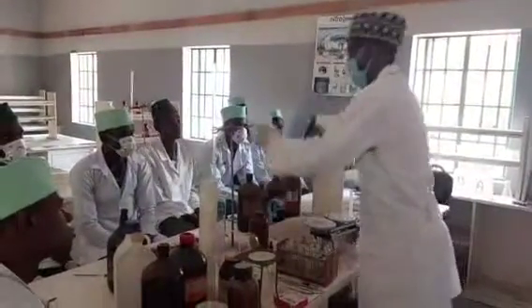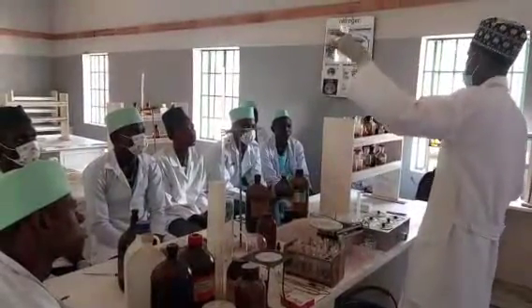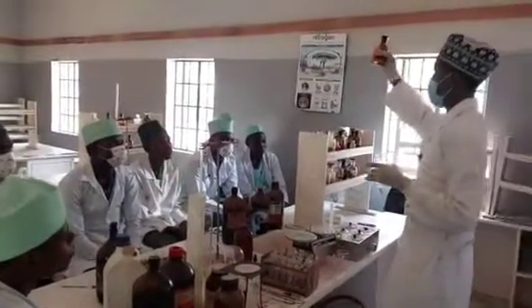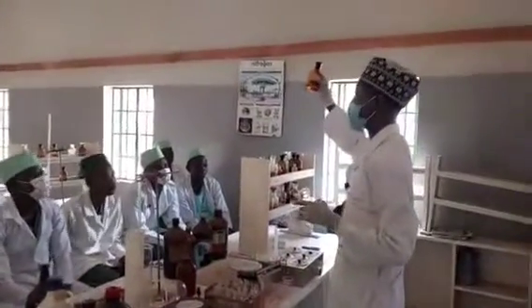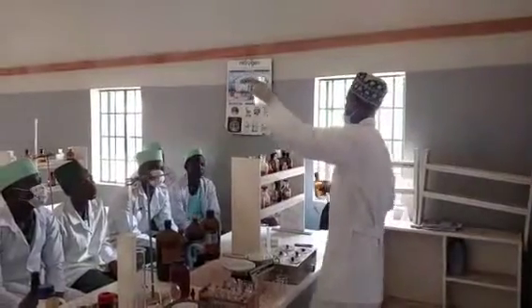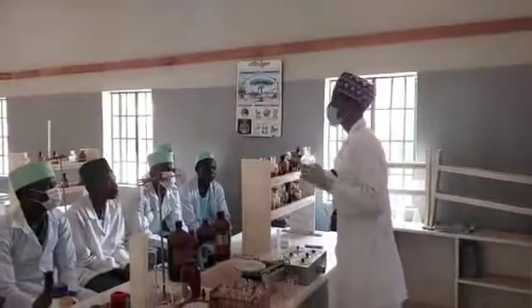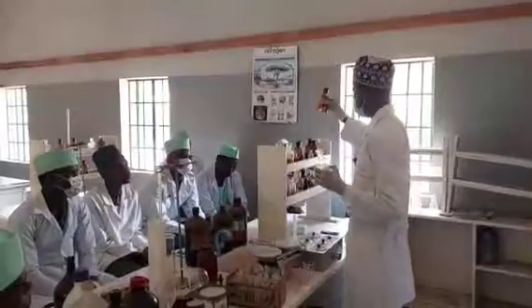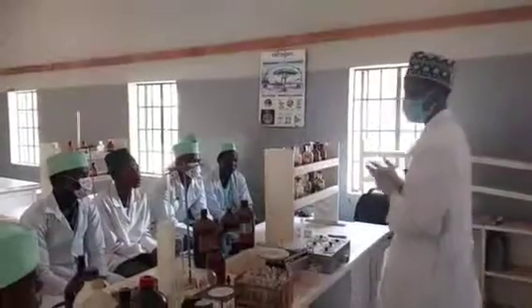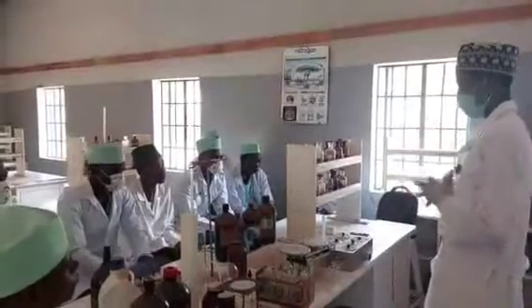All these ones are also containers or bottles. This is amber, and this is transparent. We use the amber one to store photolytic compounds, reagents or reactants. And the transparent one, non-photolytic compounds can be stored here, because the amber one will not allow the passage of light.